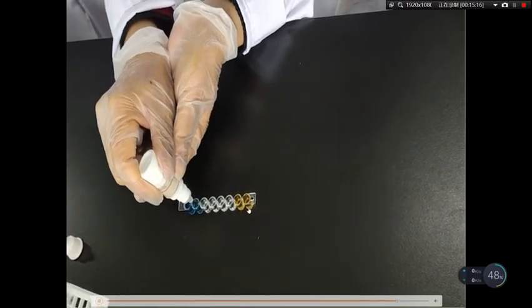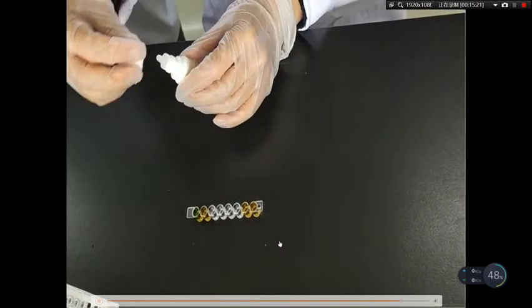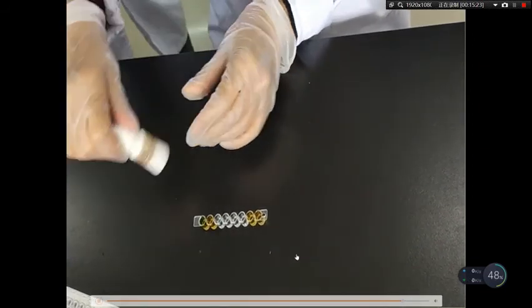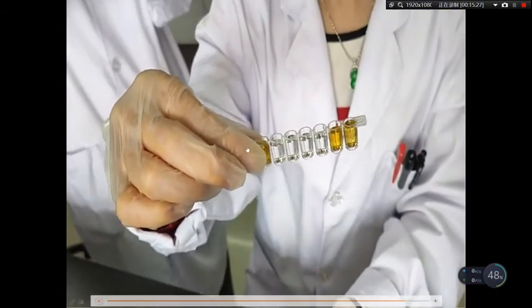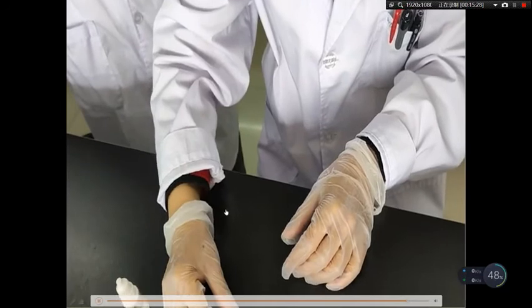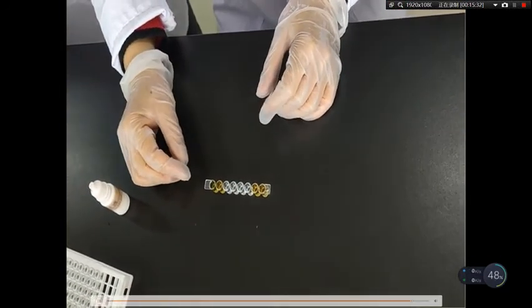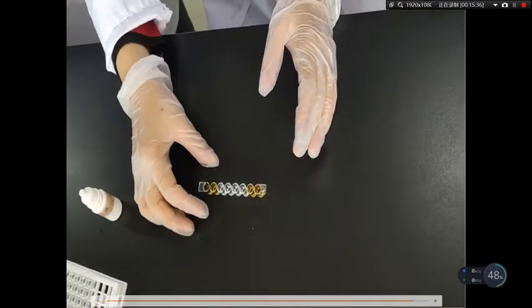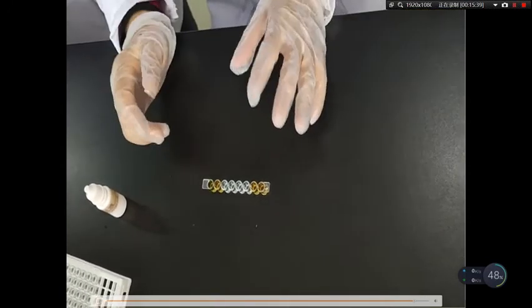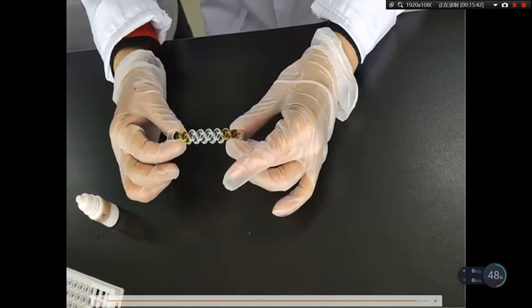After adding stop solution, we can see the liquid in the positive control and sample wells change from blue to yellow. Then we can analyze the result by spectrophotometer.